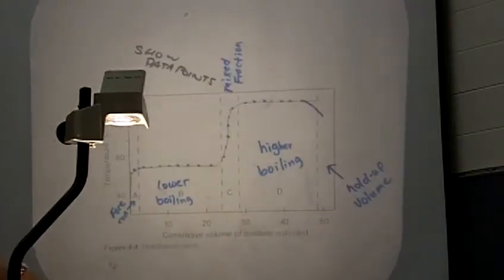Now, one thing you want to do, you're going to use your heating mantle for heating things, but you all have different unknowns. So I can't say, turn your Ohmite to setting whatever, and it's going to work for everybody. It won't, okay? So you're just going to have to turn on your Ohmite and very carefully be raising the voltage on it as you're paying attention to what's going on with the distillation, okay?